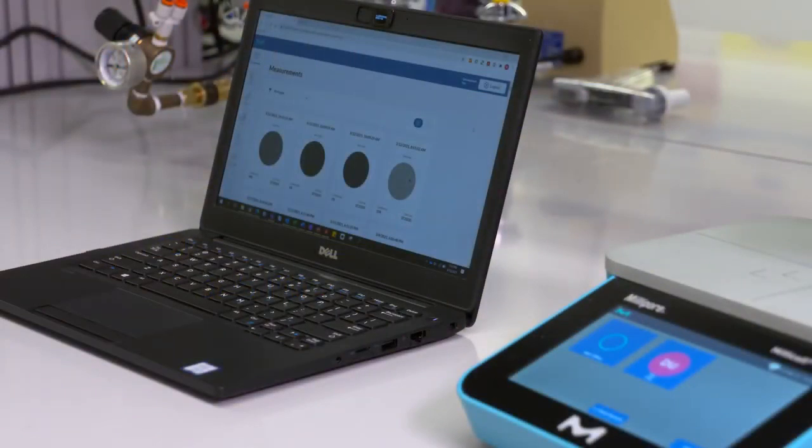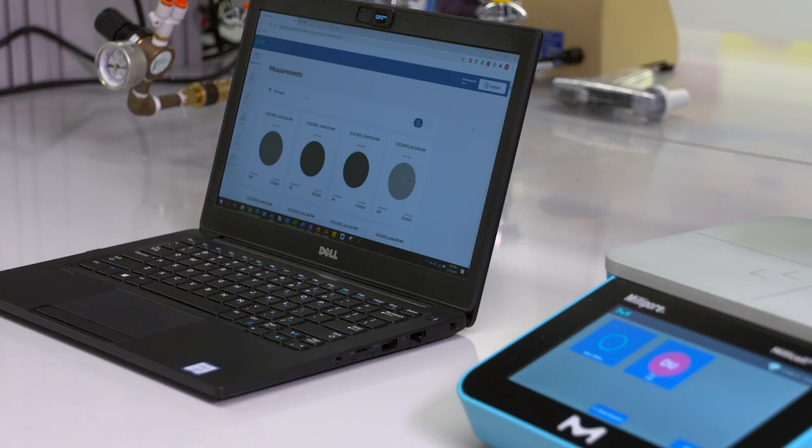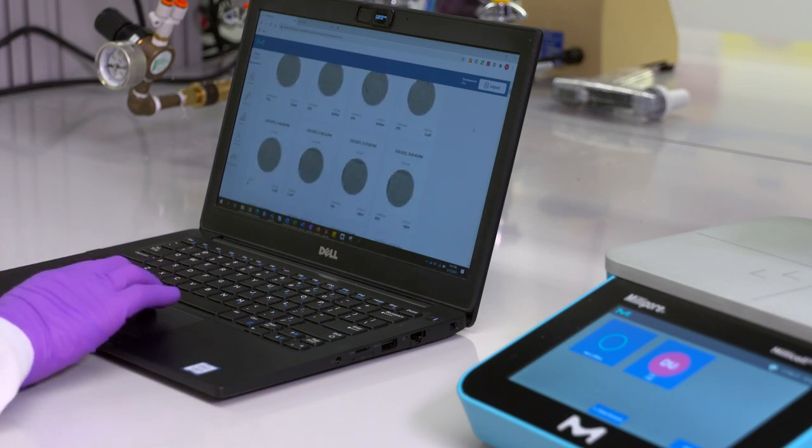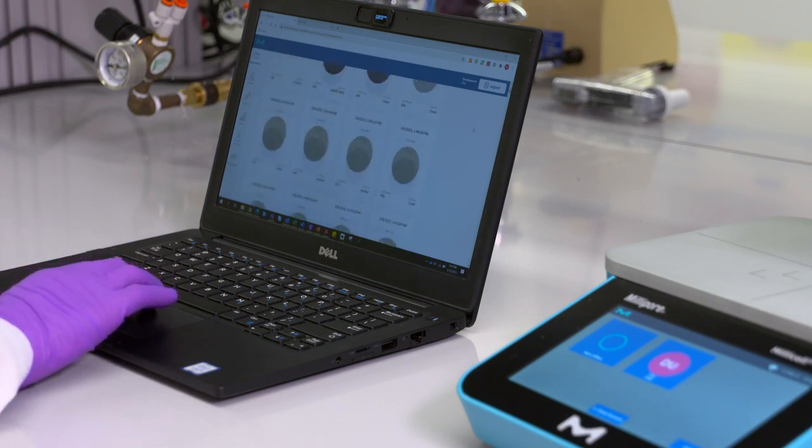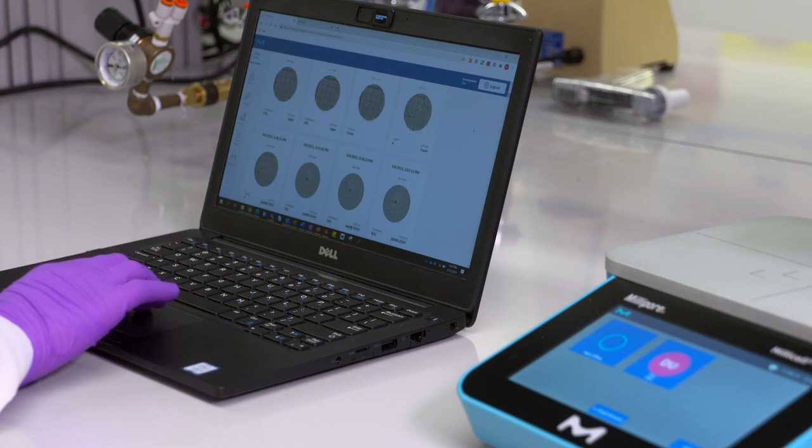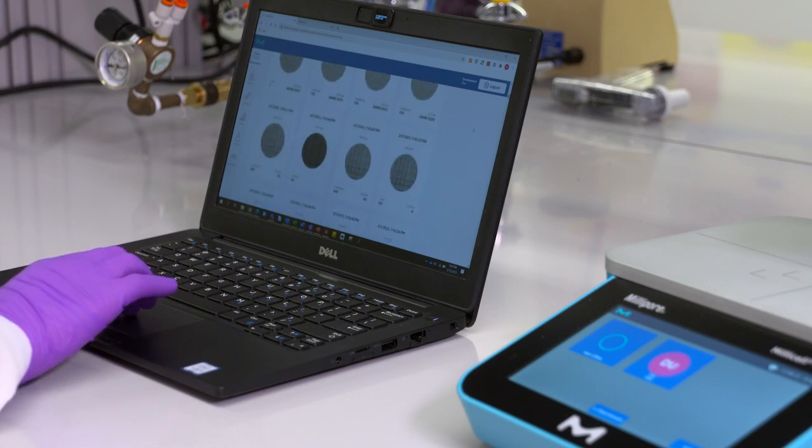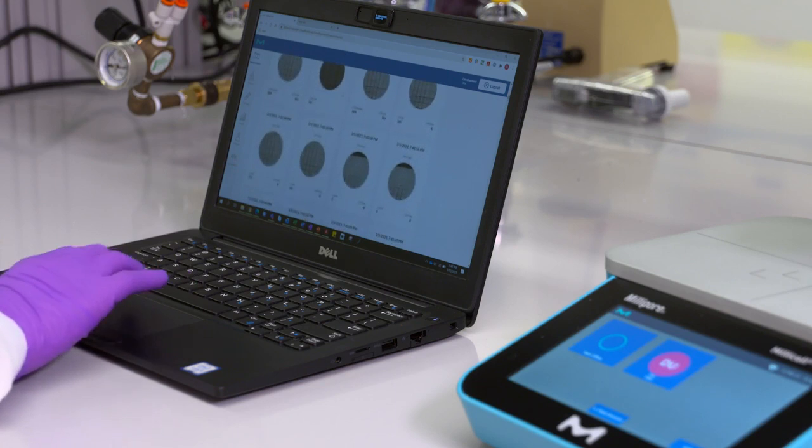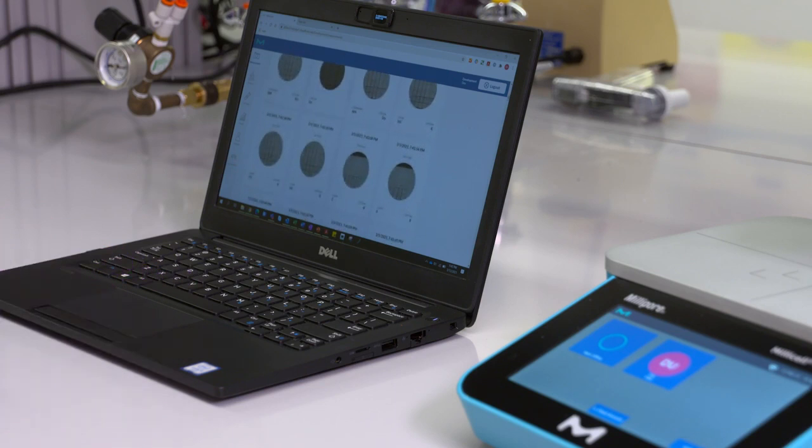The Millicel DCI is equipped with wireless transfer capabilities to the cloud, enabling off-instrument visualization, storage, and additional analysis of images. Images will be wirelessly transferred to your cloud account when connected to a Wi-Fi network.